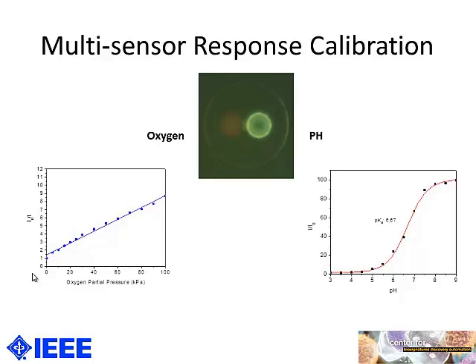So this gives us the basic concept of the oxygen consumption of the cells, and also indicates if the cell is a cancer cell or a normal cell.